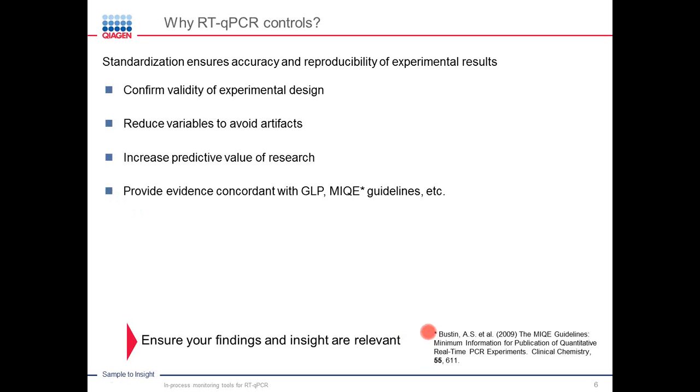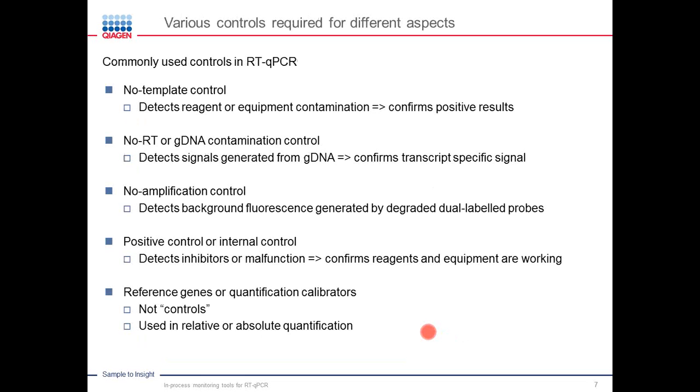If you are interested to get experts' recommendations on how to work with controls, how to monitor quantitative PCR or RT-PCR procedures, this is one of the publications that is a very comprehensive and great overview on how to monitor and make sure that the results we are reporting from quantitative PCR experiments are reproducible and meaningful.